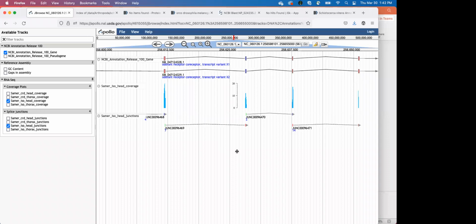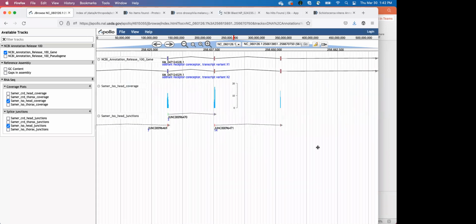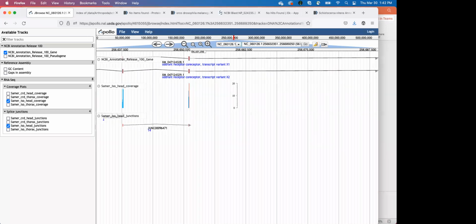And so once you get the hang of looking at these things, having these two tracks in combination really helps to see the validity of the gene models here, where you say, okay, there's support for this exon here, and there's support for that splice event based on these 7 splice events here going to this exon and so forth. So you see there's kind of a chain connecting all the different exons here. There's none right here. So this could mean that either the gene prediction is faulty or that there's just not enough RNA-seq data at this point. It's sort of ambiguous here.